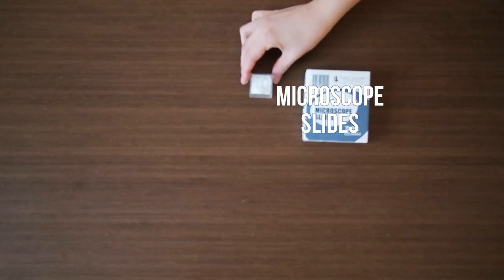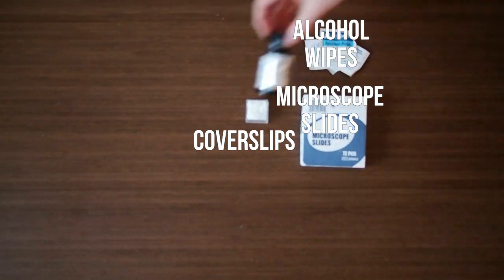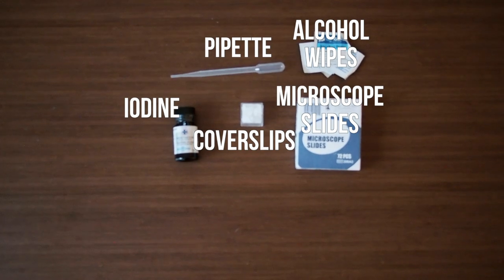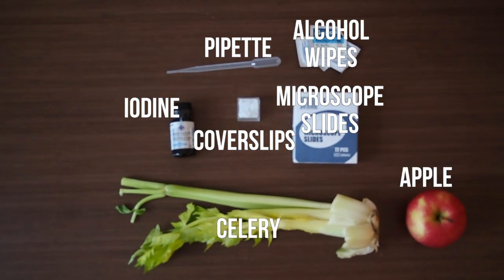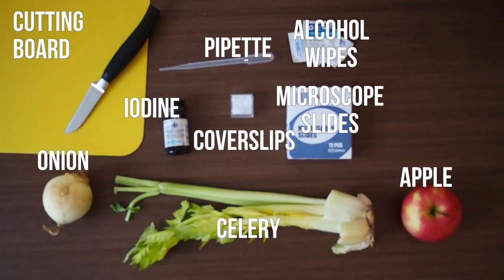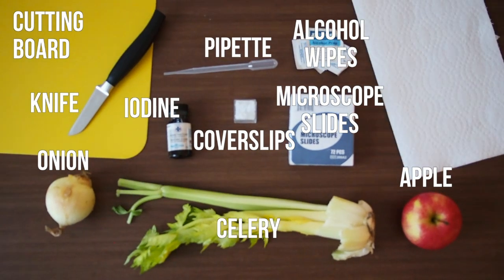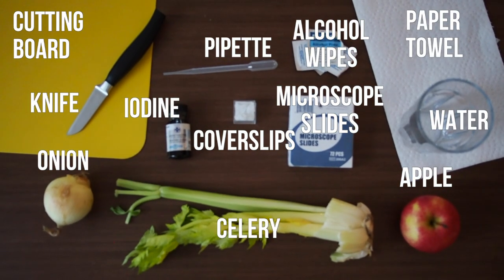You will need microscope slides, cover slips, alcohol wipes, iodine, a pipette, celery, apples and onions, a cutting board and a knife. Be sure to get an adult's help when cutting up the vegetables in this project. You will also need paper towel and water.